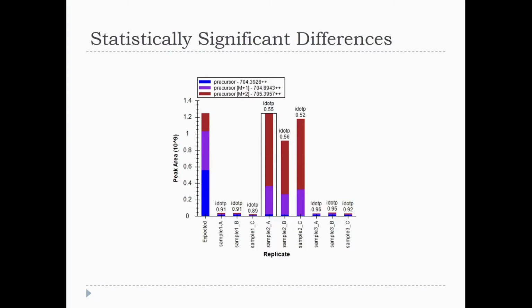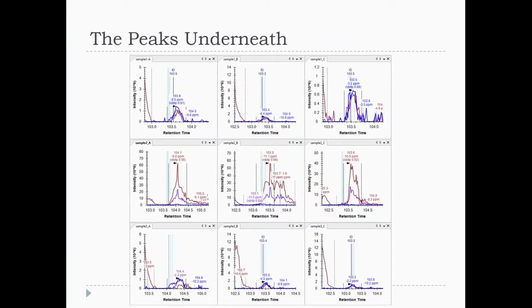But if I didn't come down to this level, I could just take these quantitatively, statistically, and say, wow, that's a beautiful change, right? If you just looked at these as bars and you didn't see the dot Ps and all the other information that Skyline's giving you, this would be a statistically significant change. And so here's our thing.